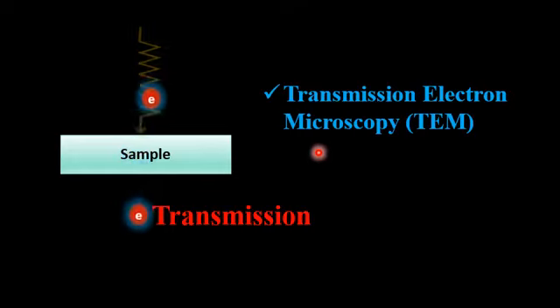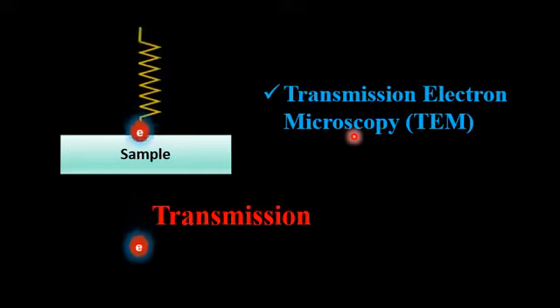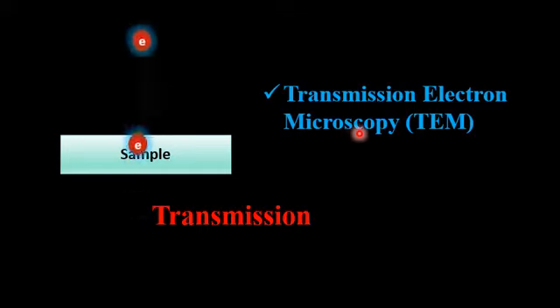The TEM is a magnificent technique because it provides information about the surface features, the shape, size and structure of the specimen through which it is passed.